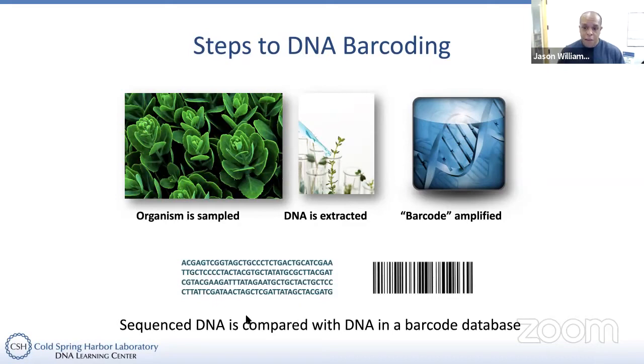So I'm going to give you some background on that, because the bioinformatics part really does not cover these top things: the organism sample, DNA extracted, barcode. It's really these bottom things, working with the data. And once you have the data, then you can go ahead and actually see the barcode, so to speak.